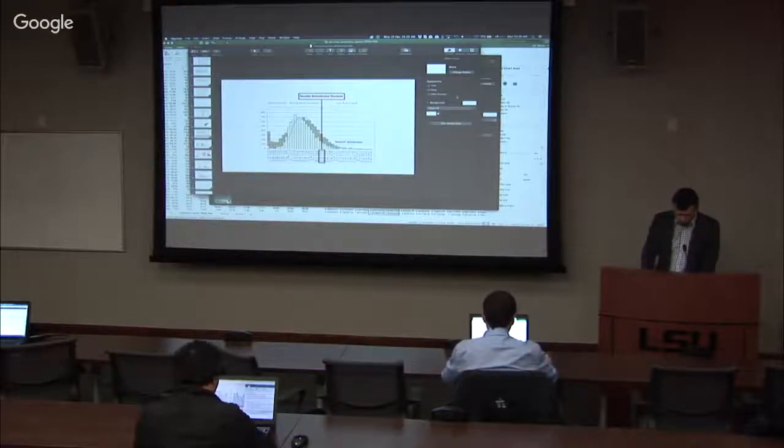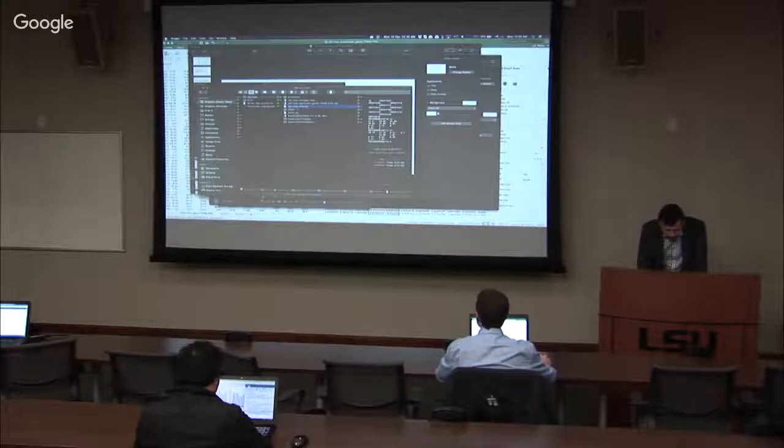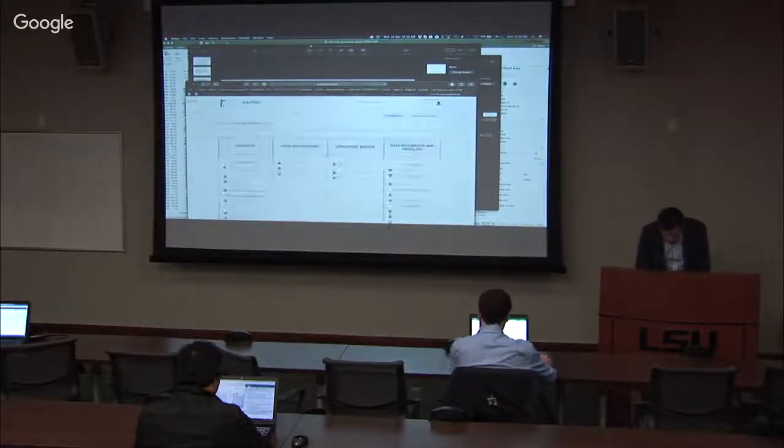What we will use is this file right here, cell lines filter 6. And we can go to the platform and just quickly do this together.